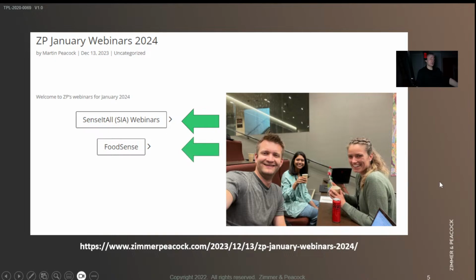Food Sense is a reflection on this. A lot of what we're trying to do at ZP is take electrochemical sensors and put them in the real world. And so we're doing that for testing the quality in food ingredients. It sounds quite funny, but we're measuring the hotness of chilies, the pungency of ginger, and also something called TAS, total antioxidative status, which is a predictor of shelf life.